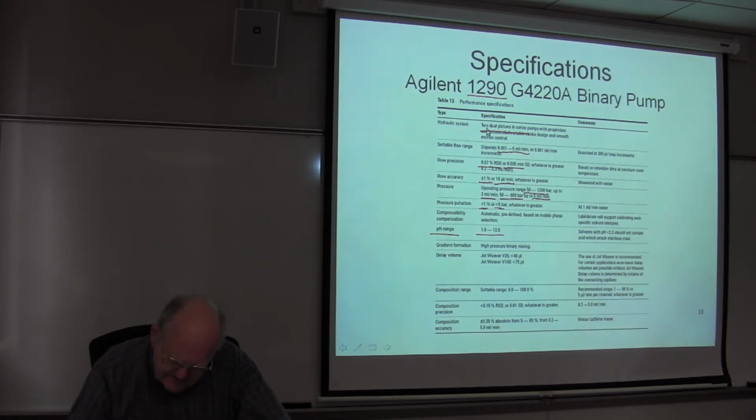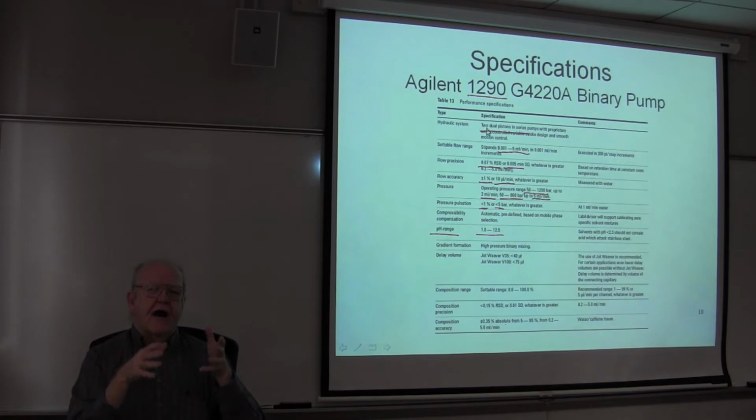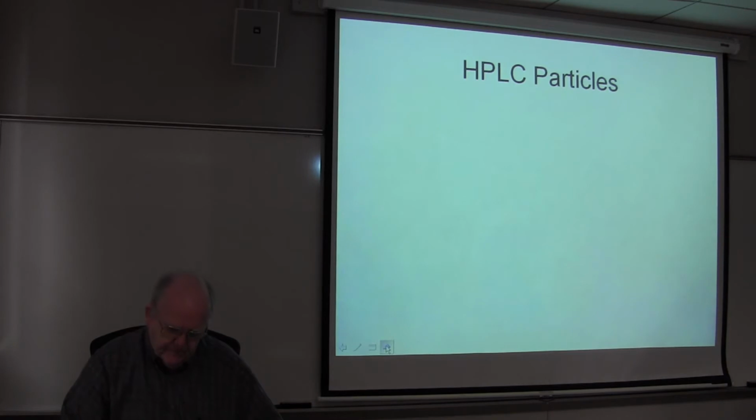And there are other interesting specs here, but I think we've covered the really important ones. You gotta know what your instrument is capable of. Don't use an instrument unless you know what it's supposed to do. All right, so we're done with the pumping system. We're gonna come back to hardware later when we get into detectors. That's another story. Okay, so particles.